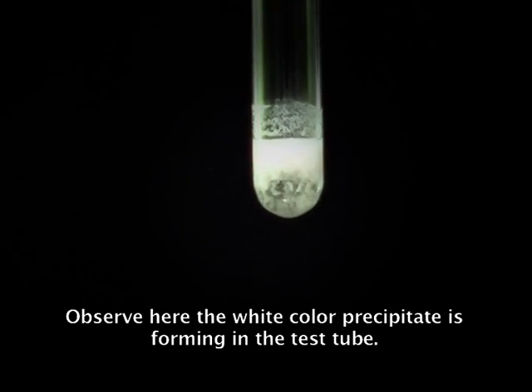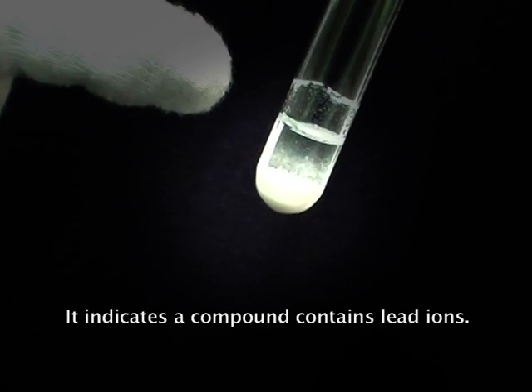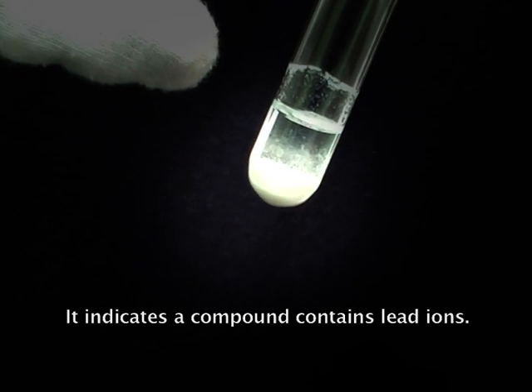Observe here — a white color precipitate is forming in the test tube. It indicates that the compound contains lead ions.